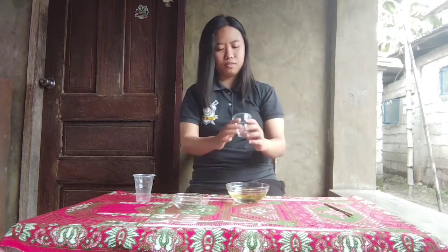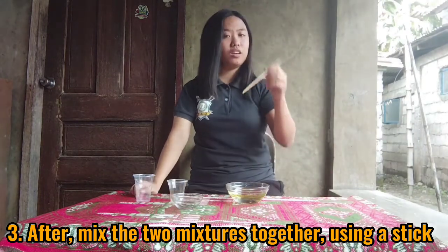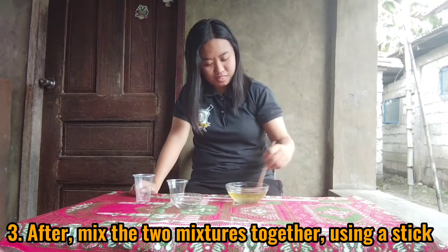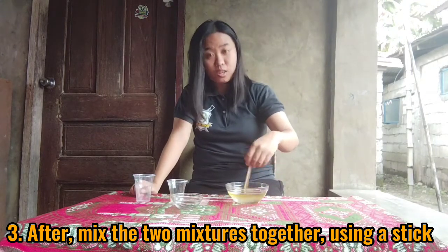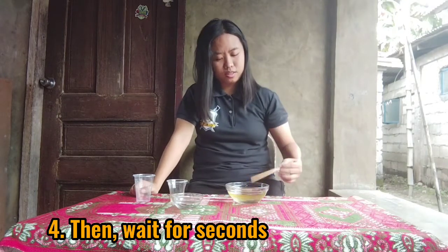After that, mix the two mixtures together using a stick. Then wait for a second.